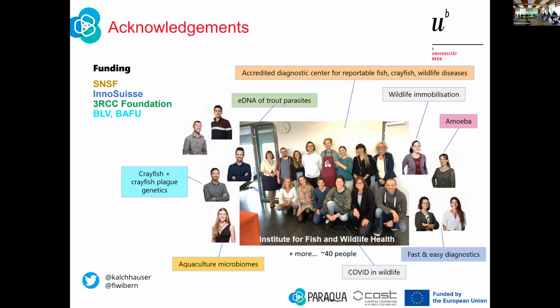And we actually have, you showed this script, the COVID tests. We're actually working on this for some fish parasites, not for zoosporic parasites at the moment, but here we try to find ways that people in the field can do it at a single temperature and so on. Amoeba and accredited diagnostic center.